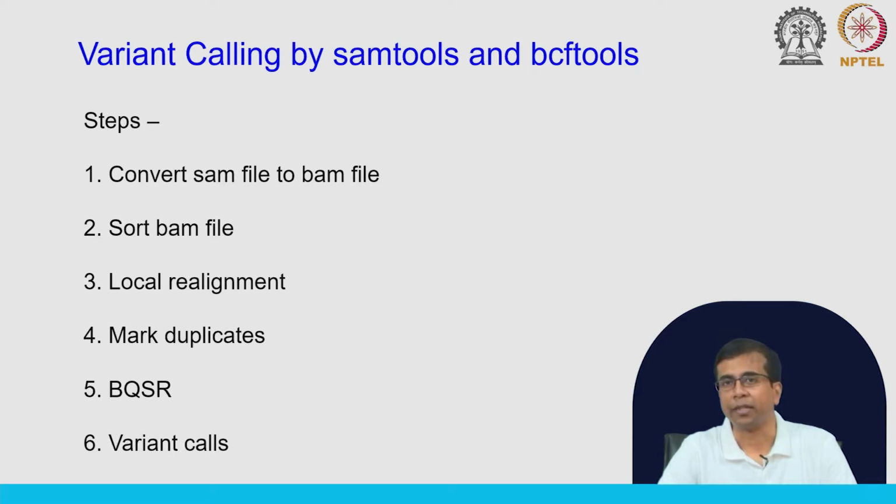It is a time consuming step, so it is not possible for us to cover this or do hands on in this class, but we discussed the idea of why we do this. I also mentioned the software that will do this for you. And then the final variant call, this is the actual variant call where we identify those variants.